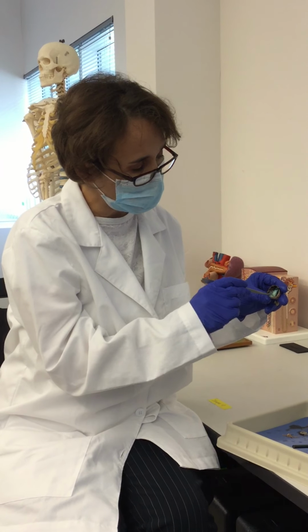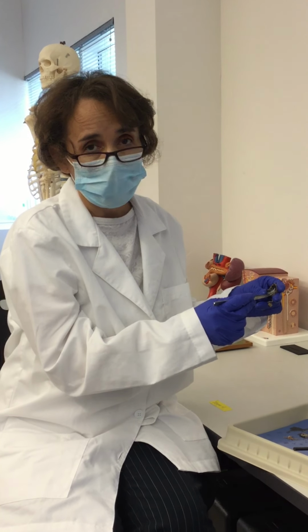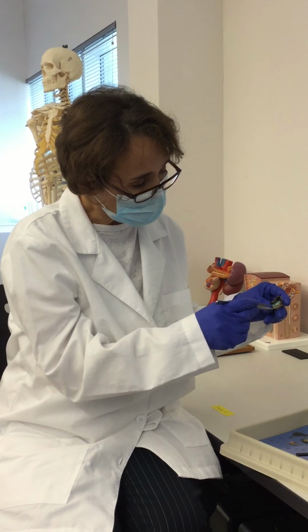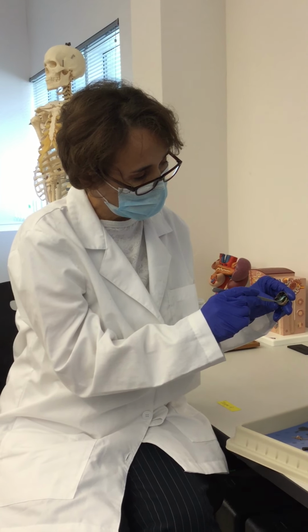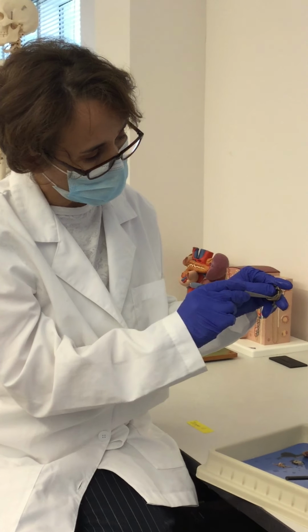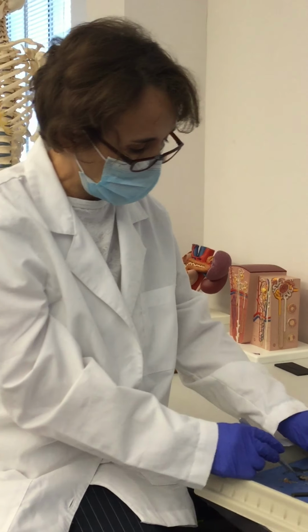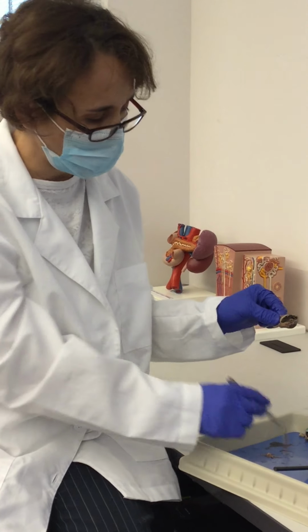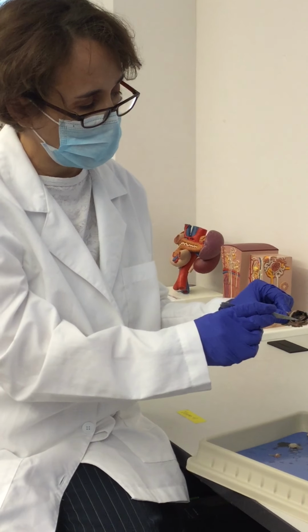So the retina is a very thin membrane, the most internal layer of the eye, located internally to the second layer of the eye, which is called the choroid. The choroid, or uvea, is where the blood vessels are located, to provide blood supply to the different regions of the eye. So you can detach this membrane. This is the retina, and then you can see this choroid, which is this membrane, and then this white layer will be the sclera, and this will be the vitreous humor, the humor that is found in the posterior cavity of the eye, and this will be the suspensory ligaments of the lens.